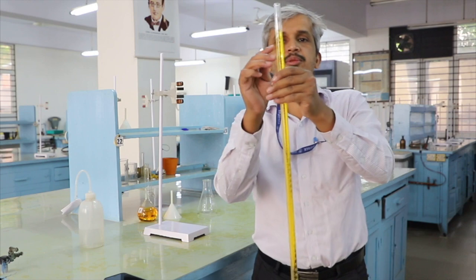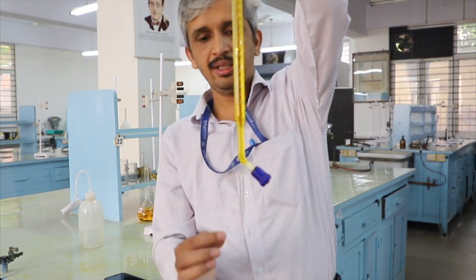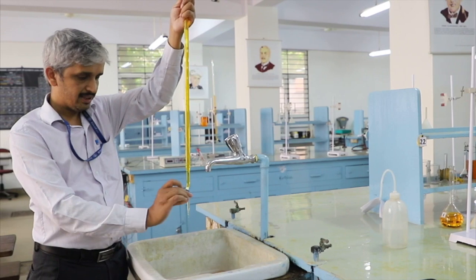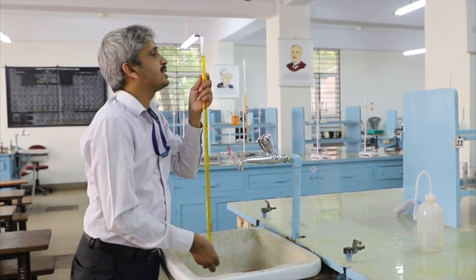I am taking slightly more than 0 because I have to remove this air bubble. This region is empty now, the tip of the buret is empty. So open once fully, so if any air bubbles are here they will go down, and then you can adjust to 0.